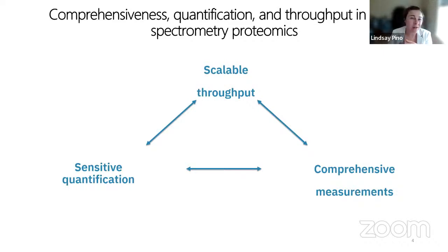You just kind of want a general idea. Is this peptide more abundant or less abundant? Some questions are very clinical, and you have to be able to say with high certainty that there is 5 picograms per deciliter of blood of this biomarker. So these 3 things are going to dictate which way you choose to run your mass spectrometer.